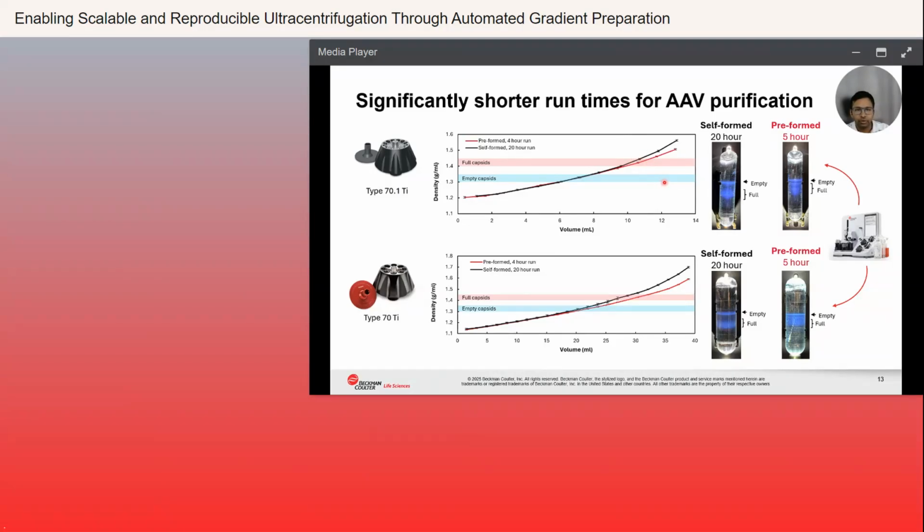But when we purify AAV 9 particles using these density gradient parameters, and in this case we will use a 5-hour ultracentrifugation just so that there is slightly better separation and resolution between the bands, there is still an observable separation between empties and fulls, though it may not exactly match up. And some of that is because of this difference that you observe. And we'll talk about this resolving of the full capsid bands into 2 bands in just a bit. Here you can actually see those 2 bands, though they may not be necessarily recoverable as separate entities.